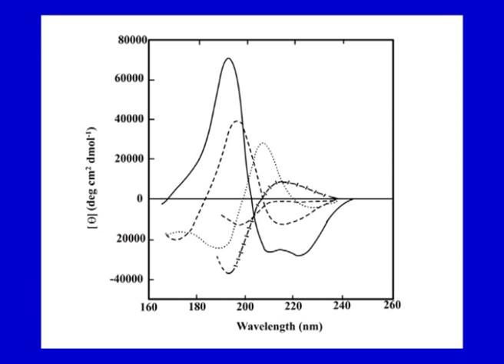And so this could be another structure here, the simple short dashed line, which you can say is an irregular structure. If a structure does not have any regularity, then it will not show very significant or clear peaks.